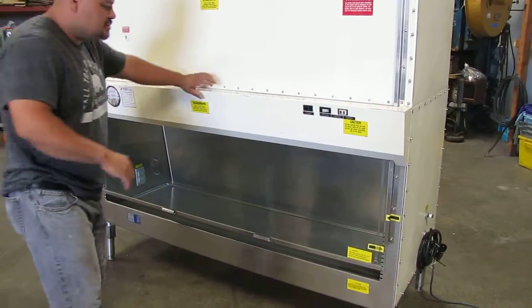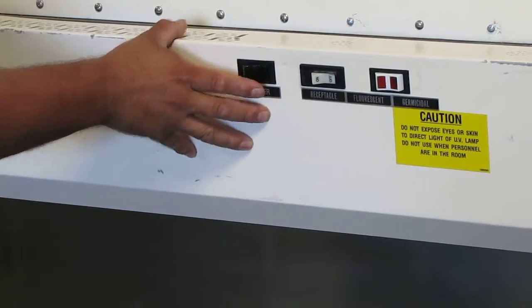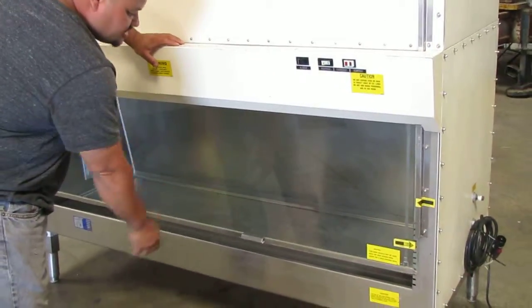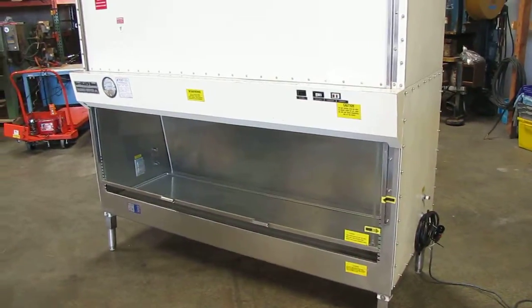First thing we're going to show you is the blower, and when you turn it on you can actually hear it turn on. That's your blower. That's pulling in suction through your vents right over here. I'll grab something so you can see.